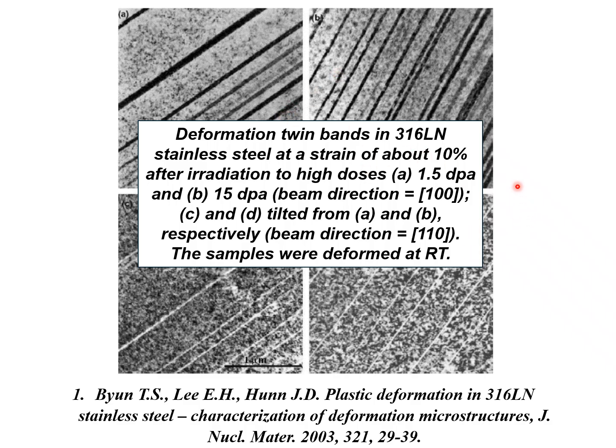They've identified them as twin bands. The issue here is whether they formed before or after radiation, and the only way you'd know that is if you can see an effect on the dislocation structure, because twinning will shear the existing dislocations or dislocation loops into a different orientation, which is likely to be an irrational diffracting vector. I'll talk a bit more about that as we go on.